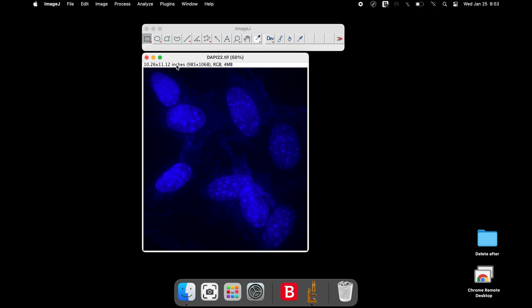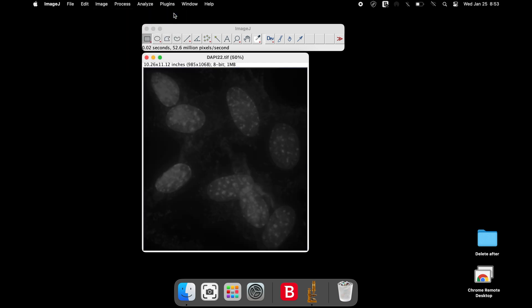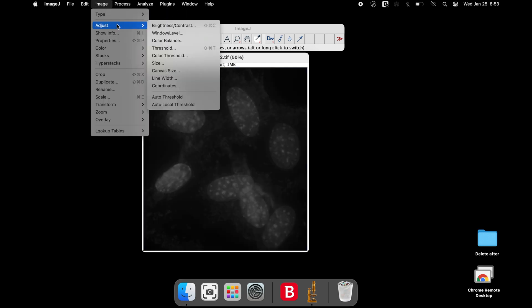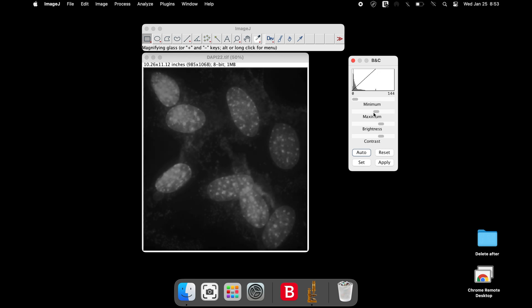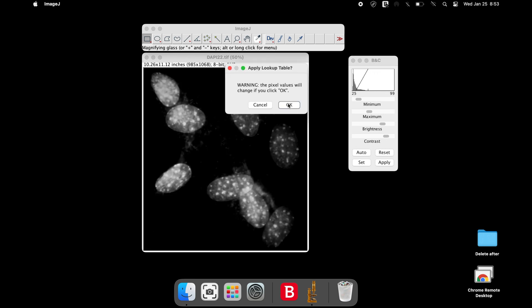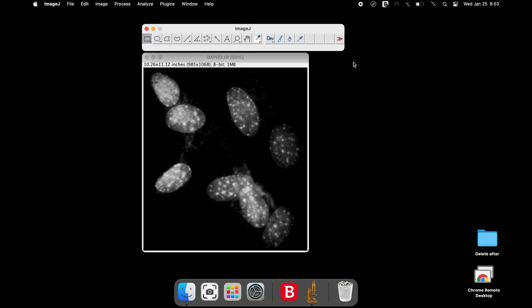The next step is to convert the image to an 8-bit image. At this point, the image can be adjusted until the desired brightness and contrast is achieved.